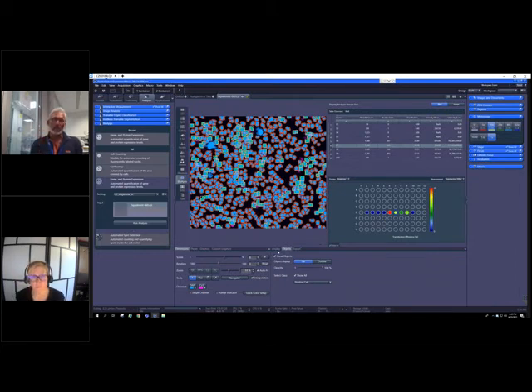It can be an image out of an electron microscope. It can be one from a dissection scope. If the other system comes equipped with a scanning stage, you can do some auto alignment. If not, you do have all the tools handy to do the alignment and make images transparent and do some overlays and everything like this.